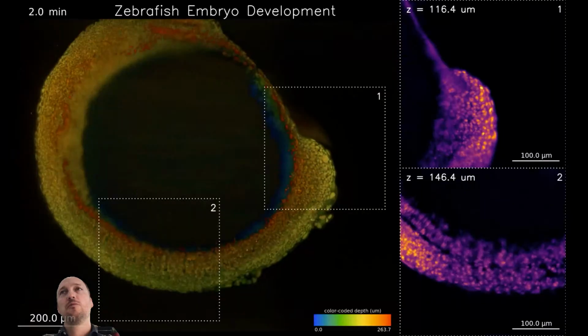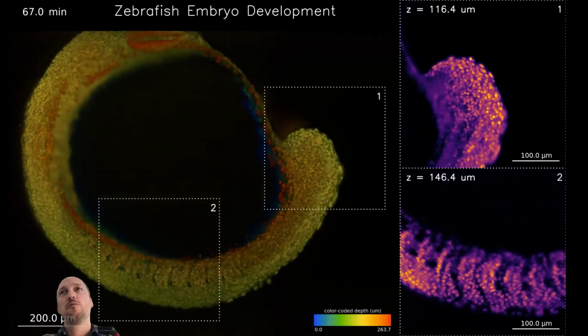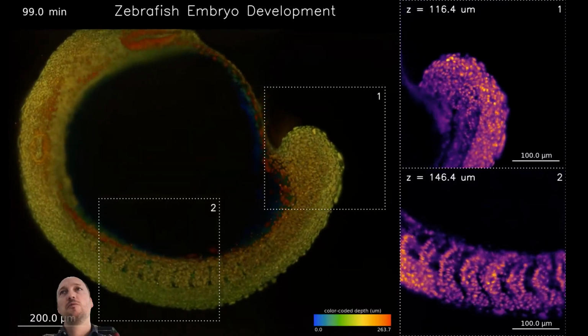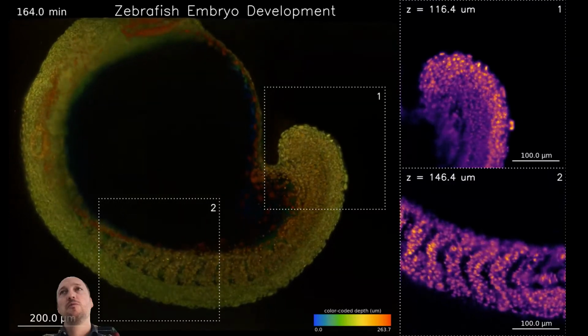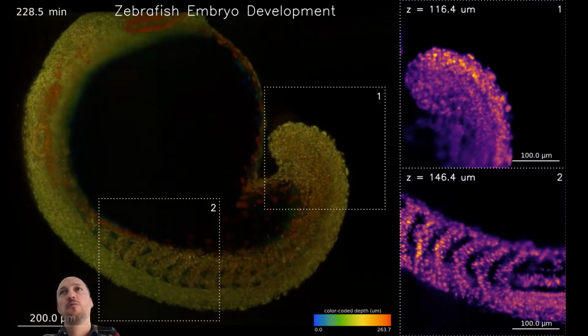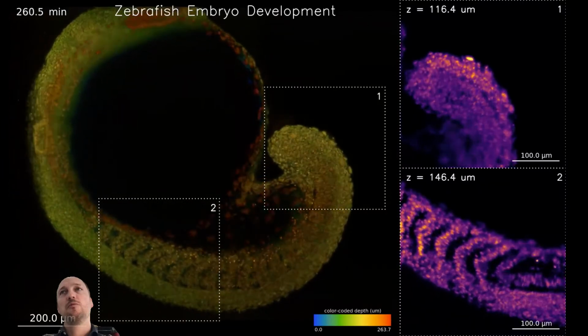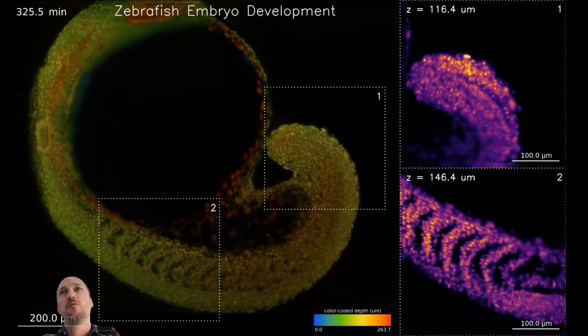So, another video, more recent actually. Perhaps the quality of the setup was a little bit more mature by then. And very nicely we're following the tail bud, growth and the tail expansion. Somites are forming there.